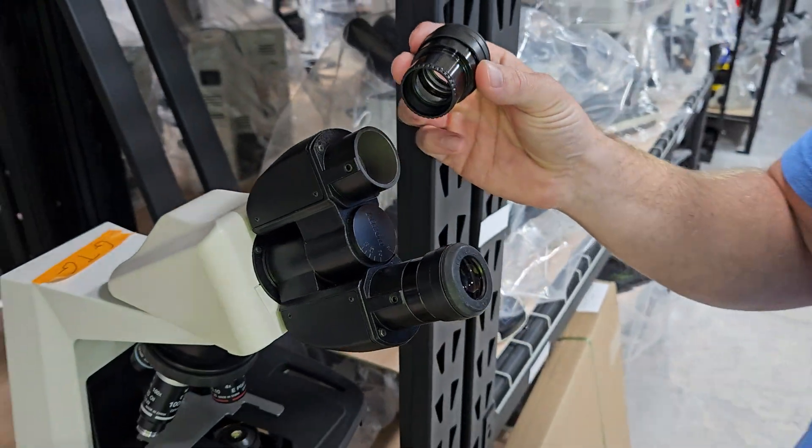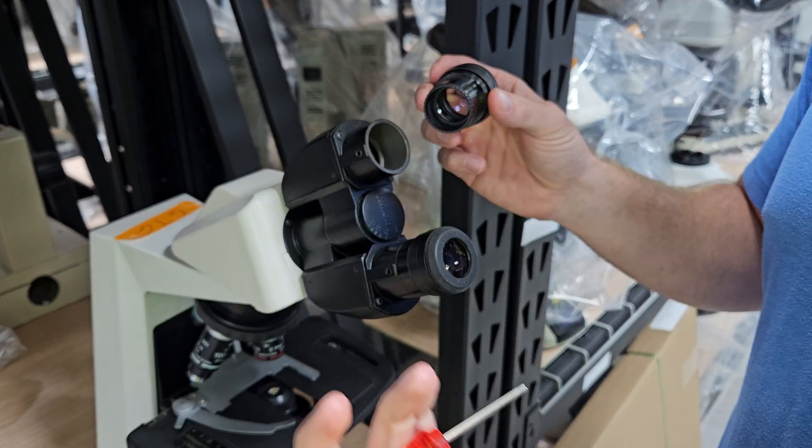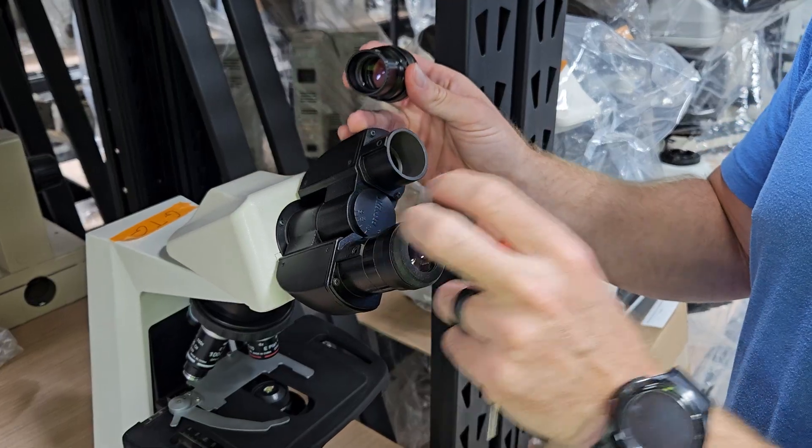This is going to be very similar on a lot of scopes. Sometimes this will be a small flathead screwdriver or a different size Allen wrench, so it'll work on pretty much any model.